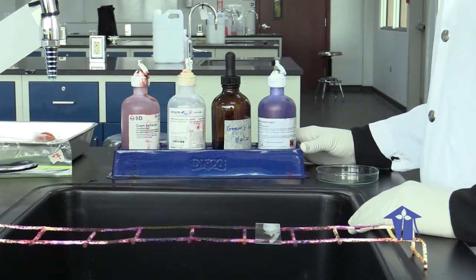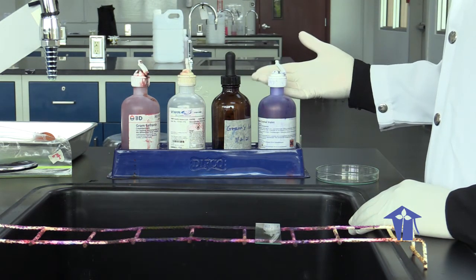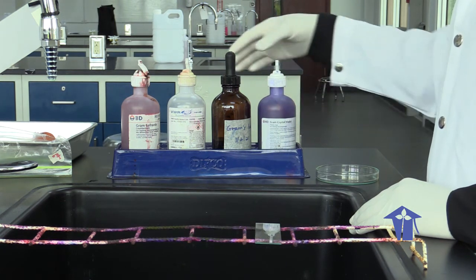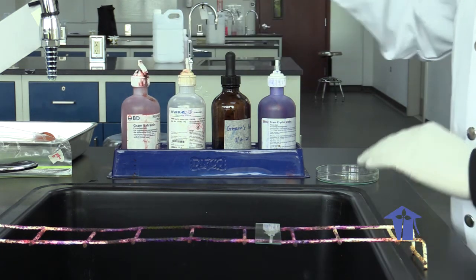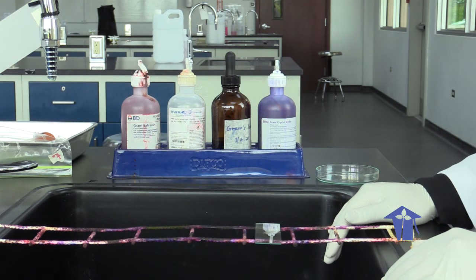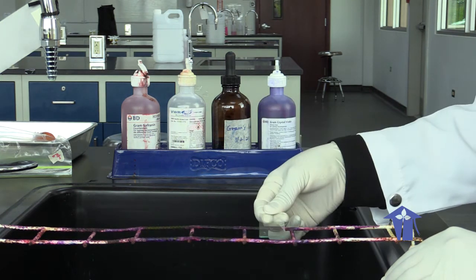For our Gram staining procedure, you will see we have all of our different requirements. We have our solutions, the first being crystal violet, Gram's iodine, decolorizer, and Gram safranin. So in your lab handout on page 30, you can follow along to be reminded of what your Gram staining procedure is. You have your specimen here, which has already been heat fixed to our slide.